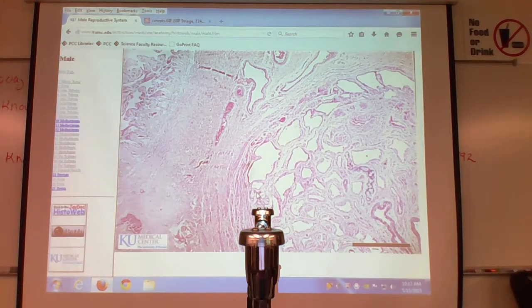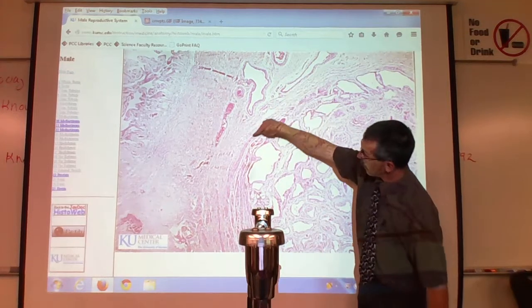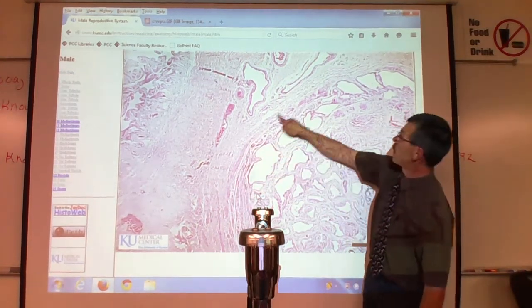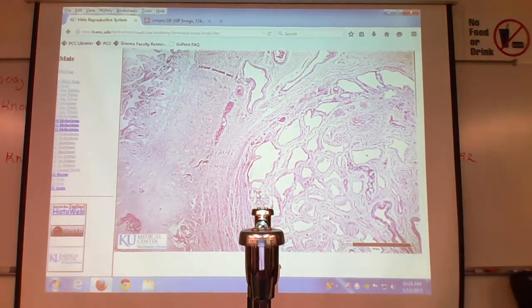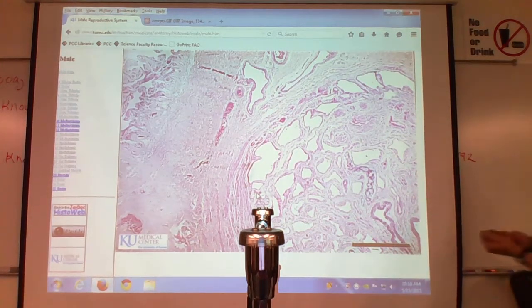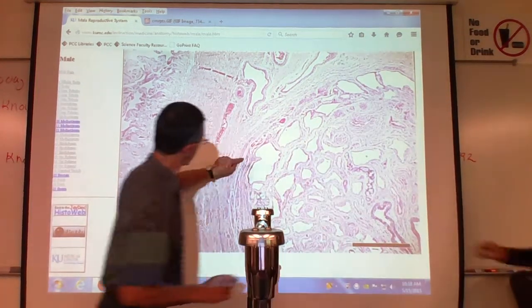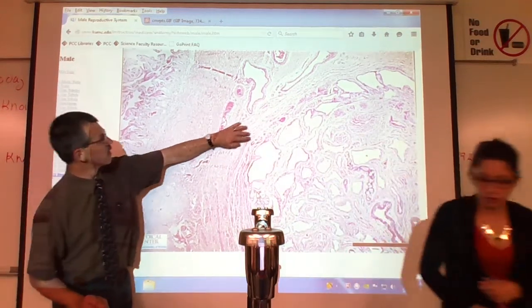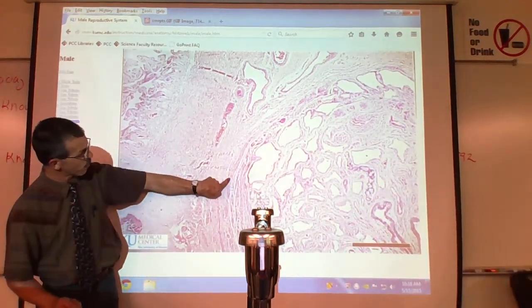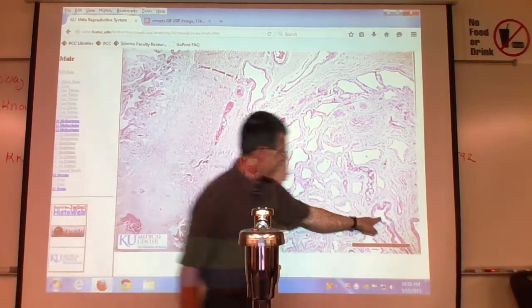Yeah, that's cool. So here's a close-up showing some penis parts, and this would be the tunica albuginea, this layer of tissue right here, surrounding the erectile tissues. So what's that thicker part behind it then? Thicker part behind it, where? Right here. That's kind of a transition. I would say that's probably part of it, but formally that's the tunica. Right here. So here's a deep artery right there.